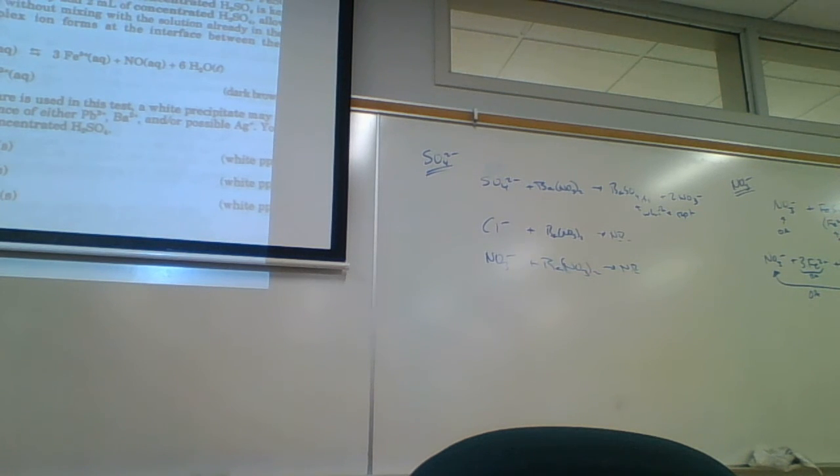So we're going to generate a gas here. We're not generating a precipitate. And so this is a CCG. CCG stands for clear colorless gas. Can we test this gas with litmus? No. How can we test this gas? Can we ignite this gas, like hydrogen gas? No.